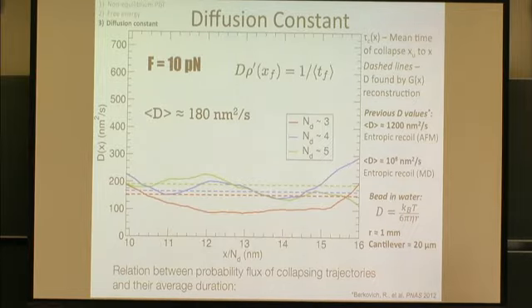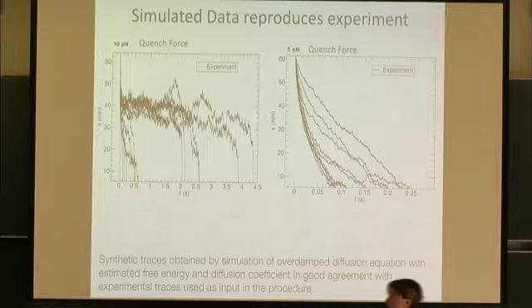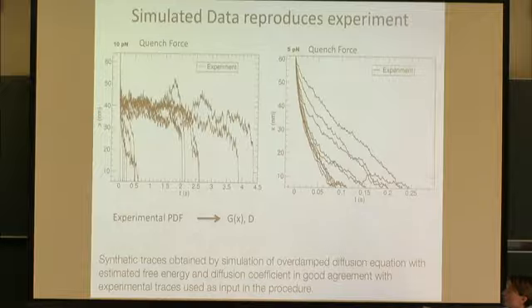So we think what we're measuring is all the internal degrees of freedom that the protein has that are being projected onto the end-to-end length, and that's what's slowing the system down so much and so crazily, and that's why we observe the collapse in seconds in the real experiment.